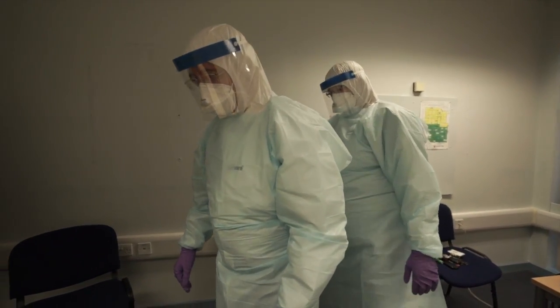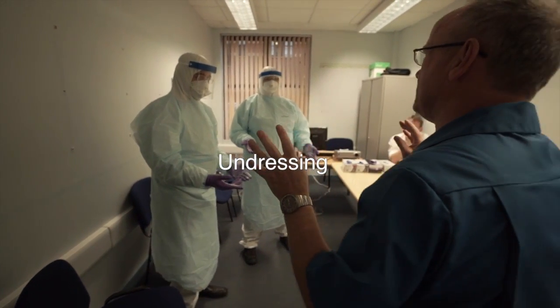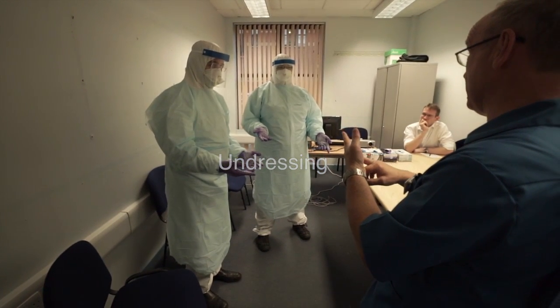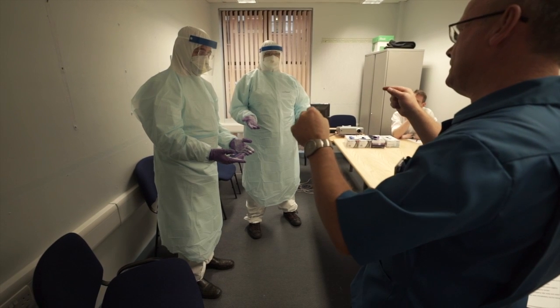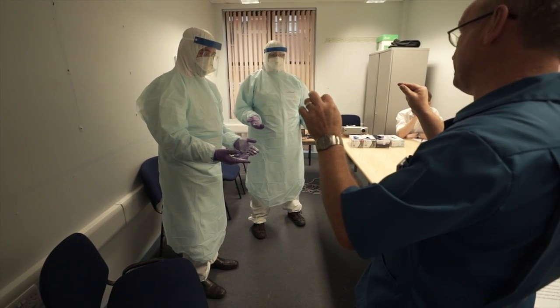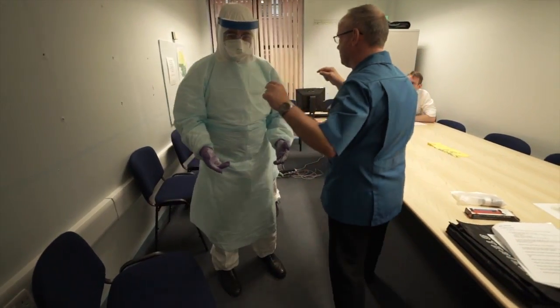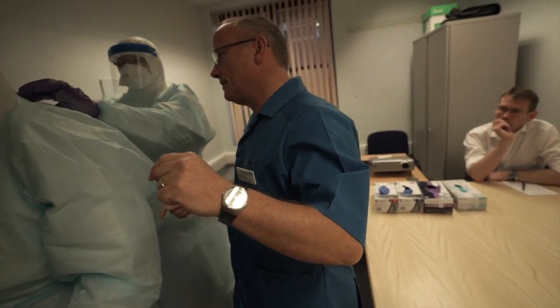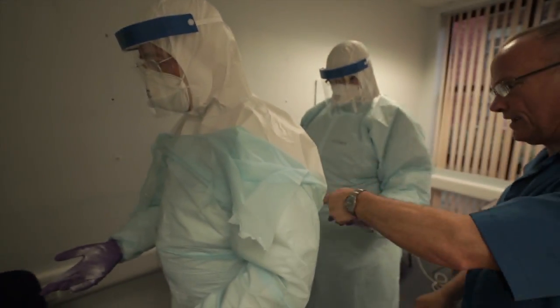You're going to touch your base layers. What we're going to do now is remove the most dangerous gear, so the apron and the outer pair of gloves come off together. To do that you need to actually help each other. So I'm going to ask you to go behind, and what I want you to do is to rip — break that — just rip it right and down so it's loose, and break that seal there.